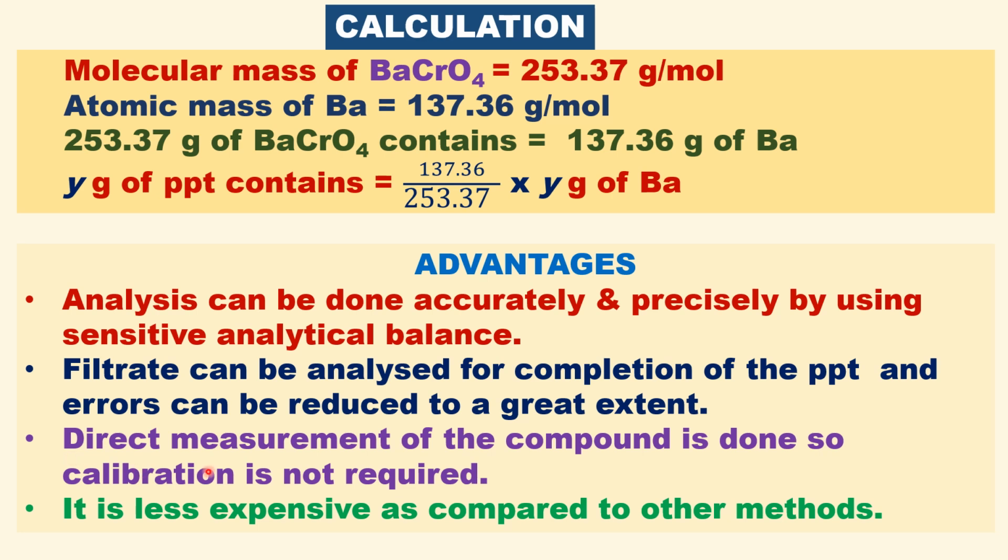Then the third point: direct measurement of the compound is done, so no calibration is required. It is also less expensive as compared to other methods.